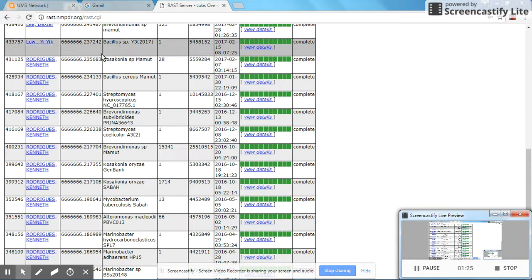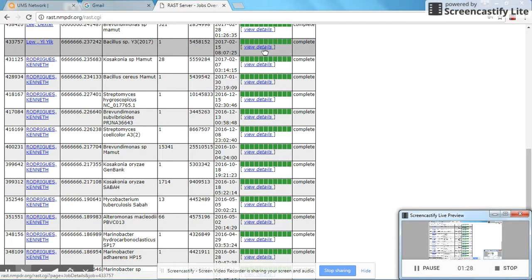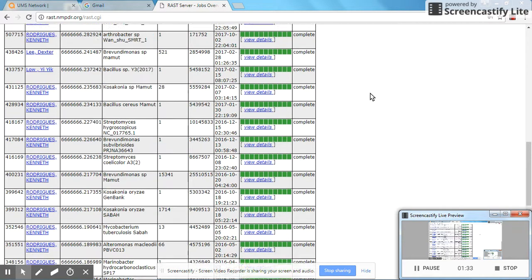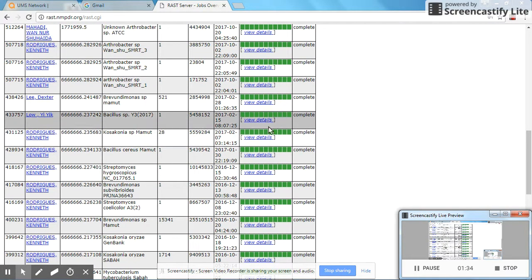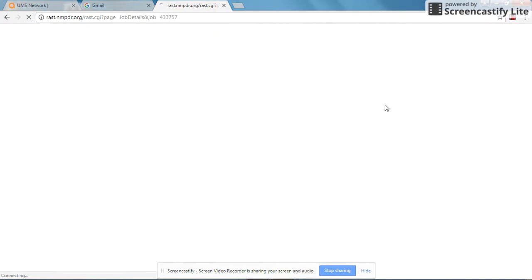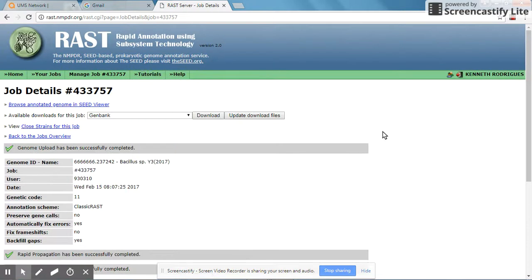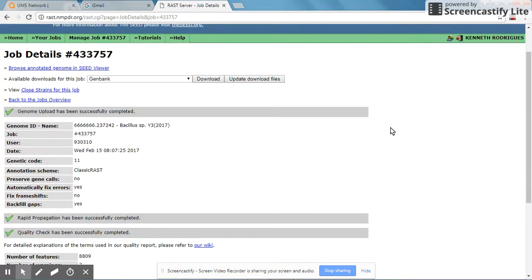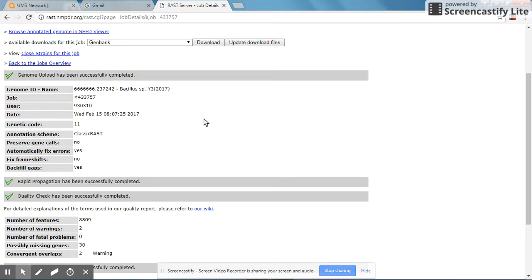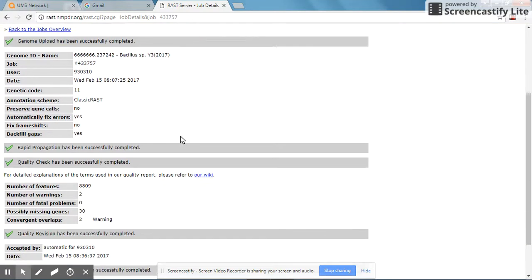Let's look at Bacillus species, which is one of the genomes that I have annotated at this server. To view the genome, you click here at View Details. The server has now completed this job, which was done some time ago.